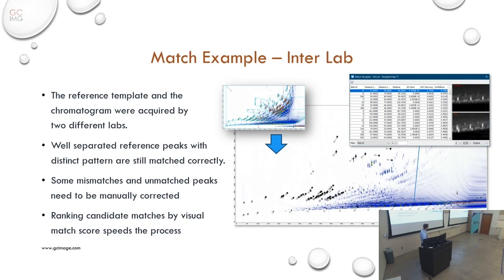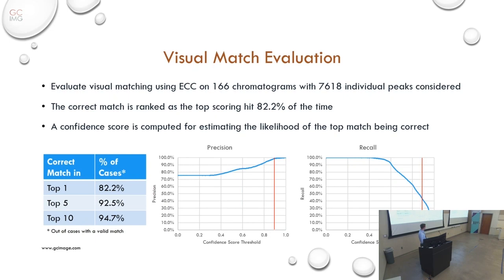For example, the N-paraffin series: each of those individual peaks, if you were to look at a zoomed in view of that peak, you would not be able to distinguish that visually from any of the others nearby in the series. So what we want to achieve with this is being able to identify a certain number of very distinctive peaks that we can match visually. And then from there, we can use those to anchor the rest of the transform and use retention time locations and distances to nail down the rest of the matches.